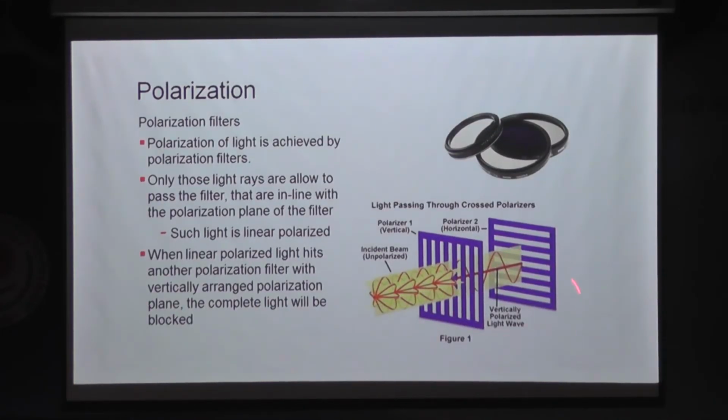The same thing is also shown here. This is unpolarized light. You can see the multiple waves in all directions. Only one wave is passing through this, and when the polarization component is perpendicular to this, nothing is being passed. So the moment I bring my specimen in between this path, I can see something coming out of the path. This is one important feature, and this is to be used only when the specimens are crystalline. I need to understand what my specimen types are also.